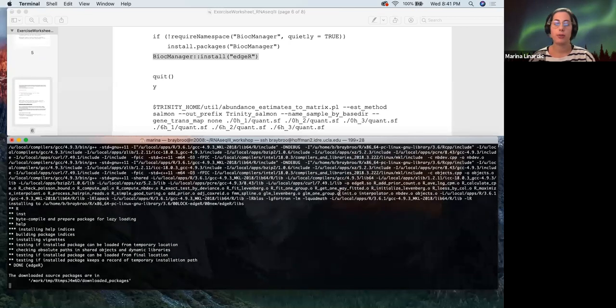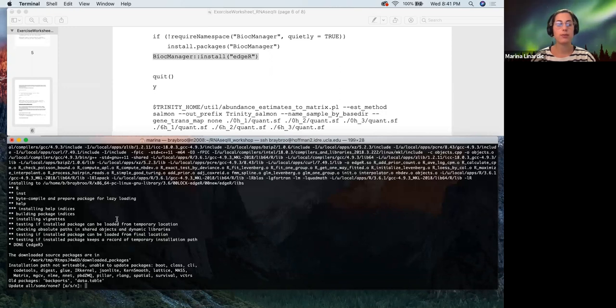What is the time? 8:41. Okay, perfect. Okay, now it's done. When it shows this, it means that it finished.